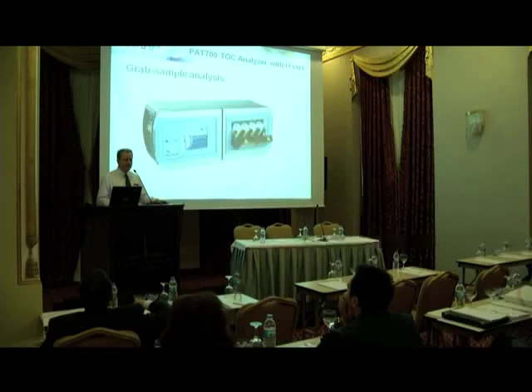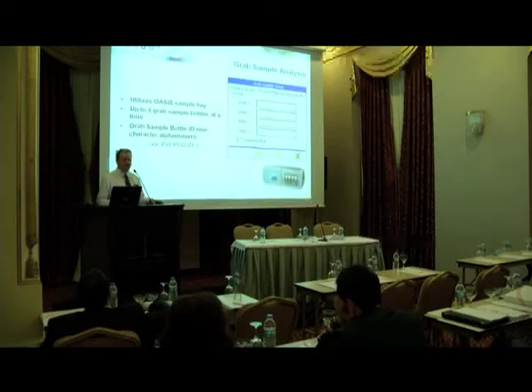So as I mentioned, this analyzer can be used for grab sample analysis. You'd load the grab samples into here, and then you would put their ID labels in here and perform the analysis.